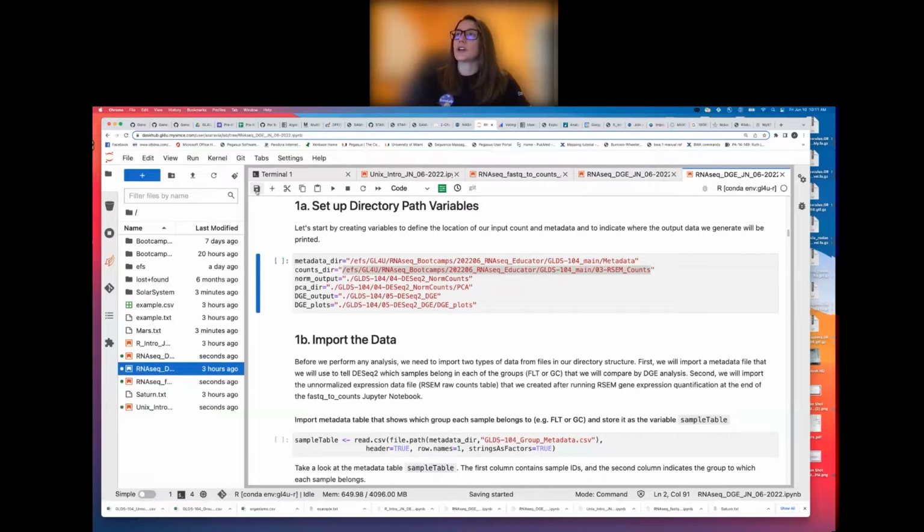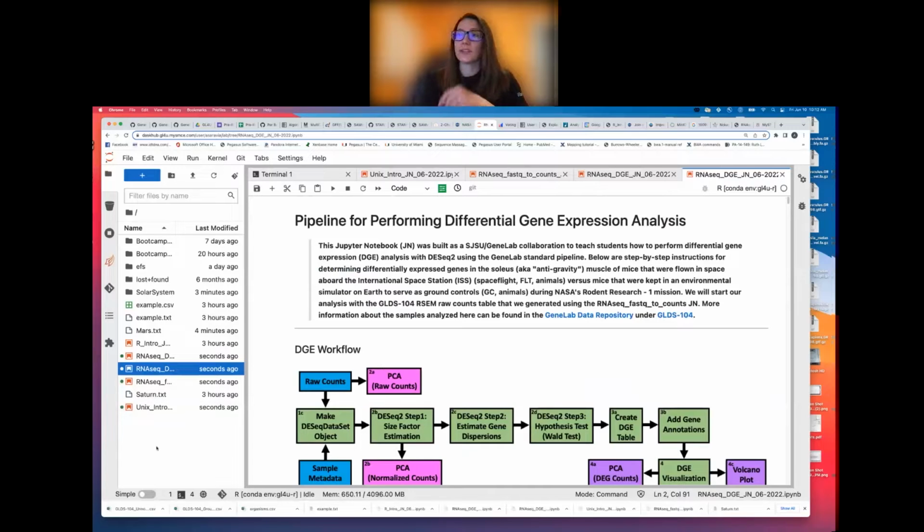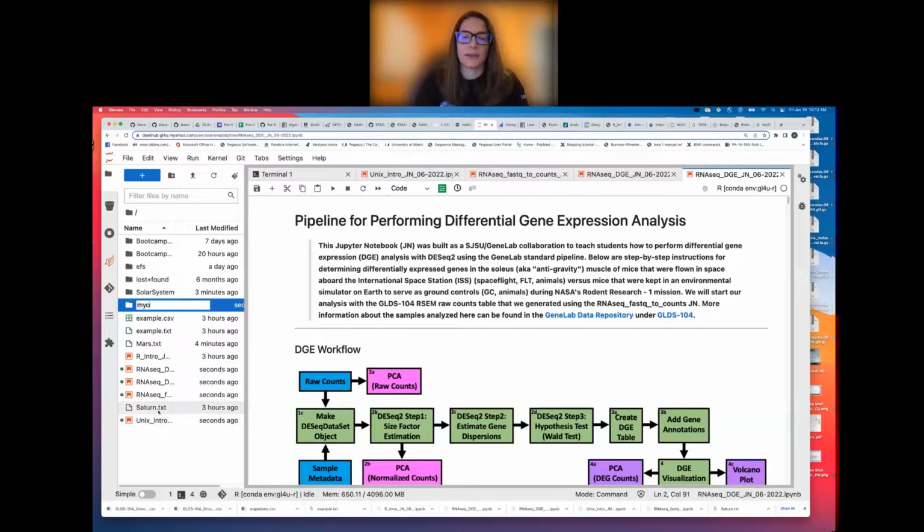And then once you've done that, if you have generated outputs, remember that when you want your students to run these, you want all of the outputs to be cleared. So if you have generated outputs, and you want a version where you already have your outputs completed, you can go ahead and make a new folder and name it however you want, like my own Jans or something like that. And then I want you to make a copy of all of your notebooks.